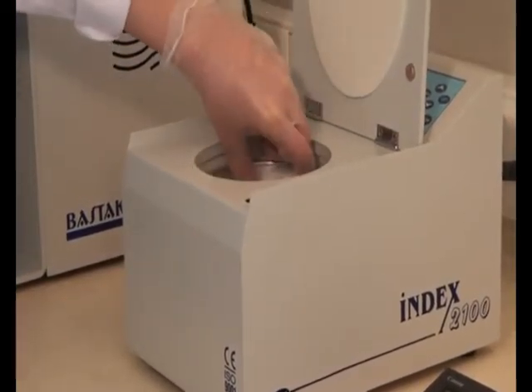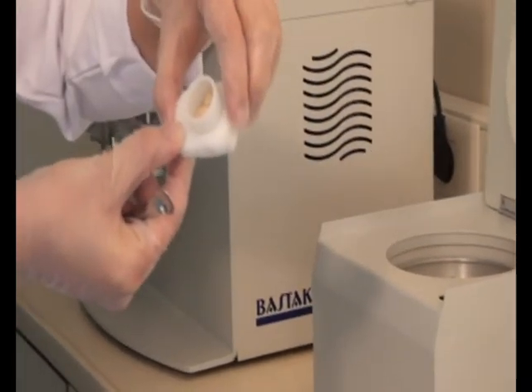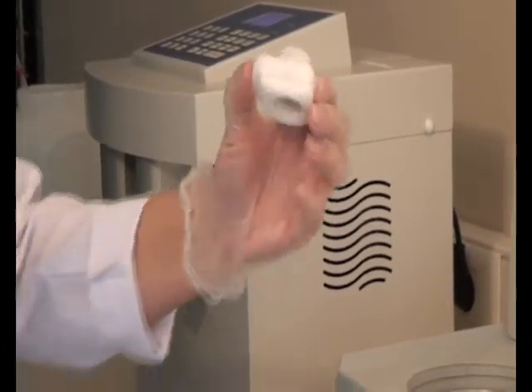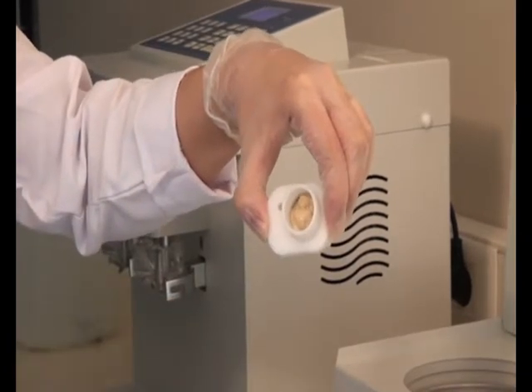Take out the cartridges. Wet gluten which has passed through the cartridge sieve is named as weak gluten, and that which has remained on the other side of the sieve is named as strong gluten.